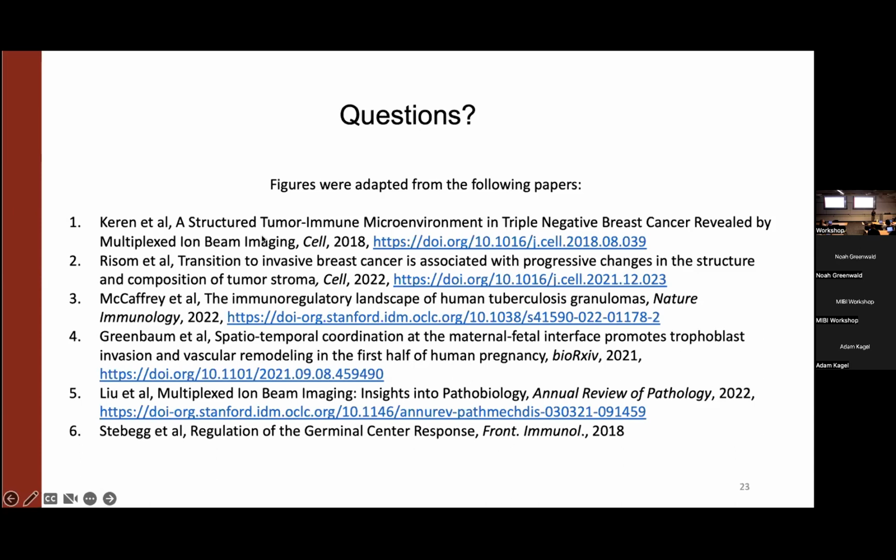But I wasn't talking about the question was like what is the feature. Oh, I see. Include them into this. Good, like ECM and yeah. Like using the pixels that comprise these features, yeah, that would be a way to integrate them in. Yeah, I mean, right now, maybe one thing you could do for stuff like collagen, these extracellular matrix components, is you could maybe randomize cellular objects with respect to ECM pixels.